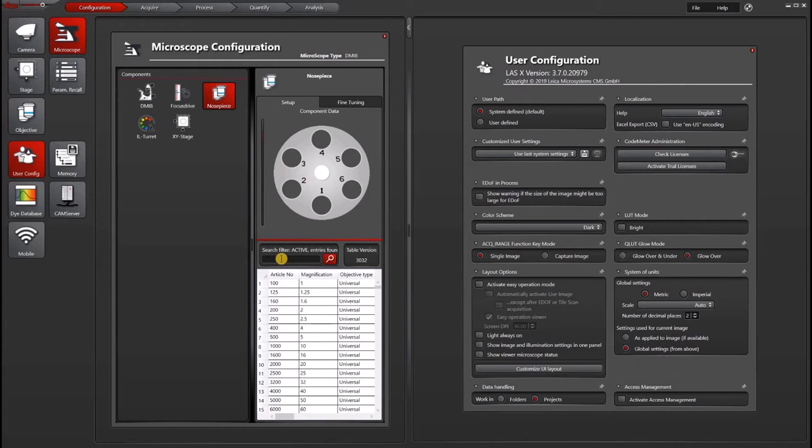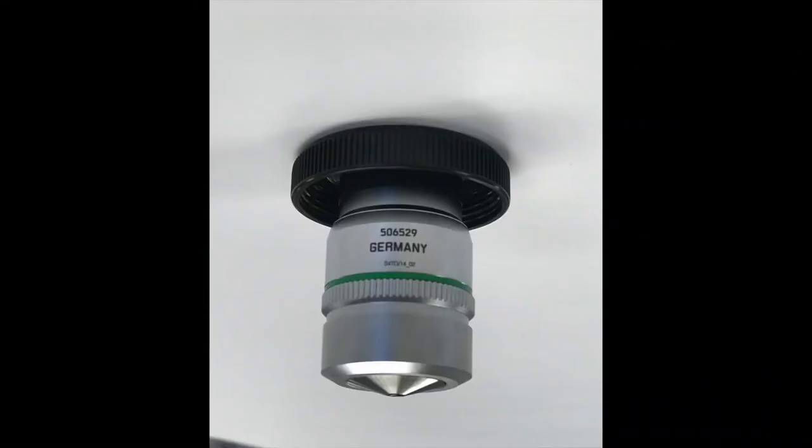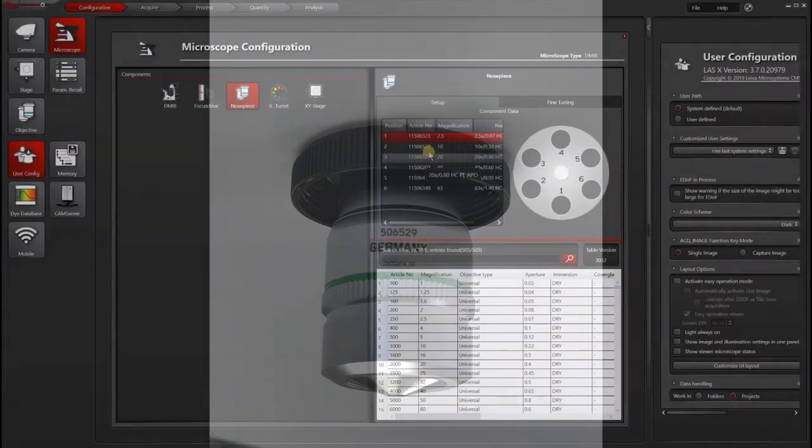Under the article number, the best thing to do is to look on your microscope objective and look for a six digit number. It usually starts with 506. I have a picture here showing you this number on one of our microscope objectives.